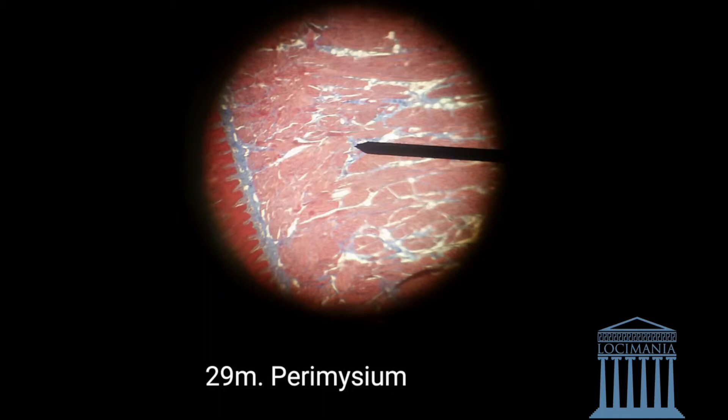If you look really closely, you can see the blue staining — that's the perimysium. It is also connective tissue, but it is surrounding the skeletal muscles.